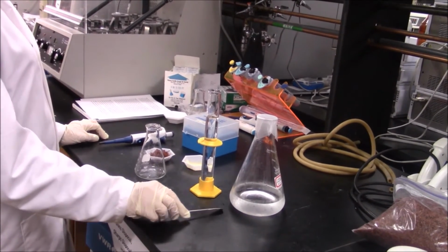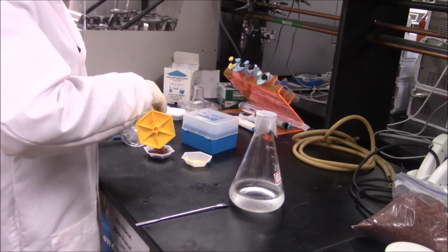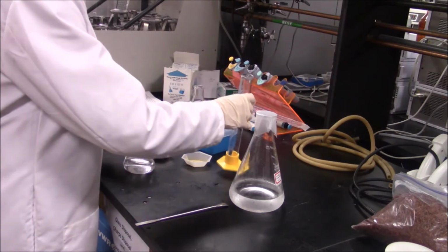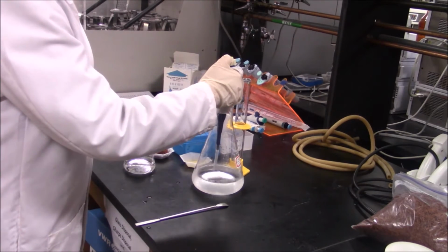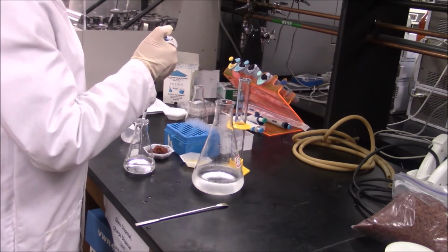Using the 100 milliliter graduated cylinder, measure out 95 milliliters of distilled water and pour it into a 250 milliliter Erlenmeyer flask. Then, using the 100 to 1000 microliter pipette, measure out 5 milliliters of the sodium citrate buffer and add it to the flask.